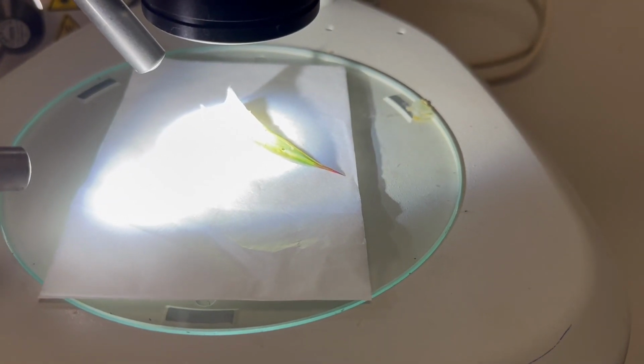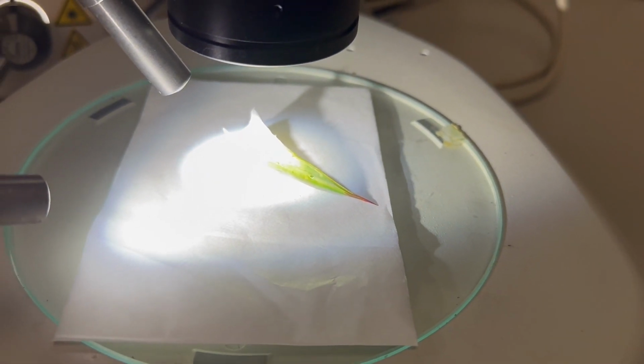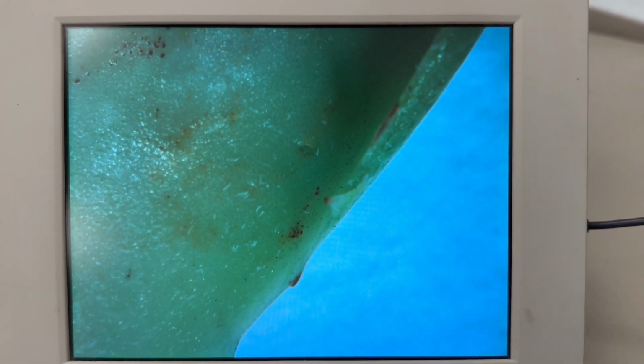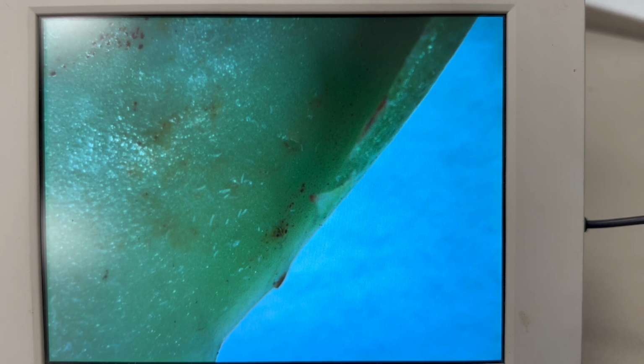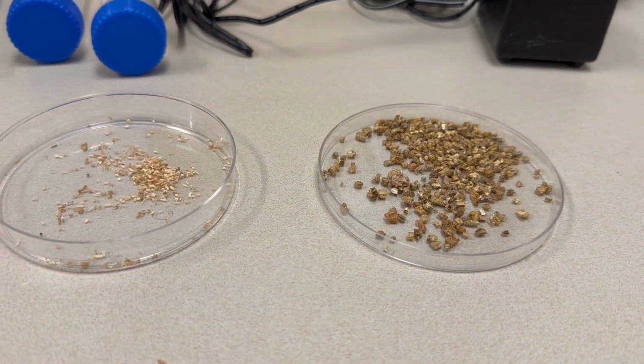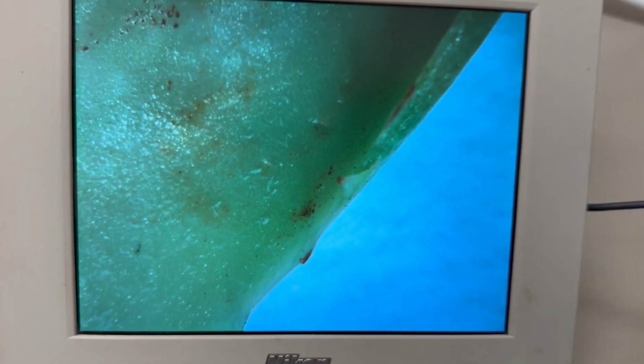All right, and now we have a small leaf from a small blue glow agave right there under the scope, and there we have a bunch of agave mites, those little white moving things that you see here. Now Eric went to get a paintbrush, and we're about to brush some of these predators, which are maybe 5 or 10 times larger than the agave mites, onto the leaf, and we're going to see what happens.